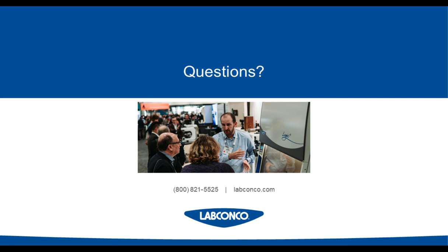Thank you for that. And similarly, another audience member says, I am a BMET. Are there any special steps to replace the UV or working light, and do I need to perform a decontamination process? The UV light on a biosafety cabinet from Labconco is located in the work zone, so it is in the contaminated space. Prior to doing any work, you want to first make sure that the inside of the biosafety cabinet is fully disinfected, and that means wiping down all the surfaces, including the UV light. To change that bulb, the process is fairly simple on our BSCs. It's just unplugging the power, removing the bulb, replacing the bulb, and then resetting the UV timer.